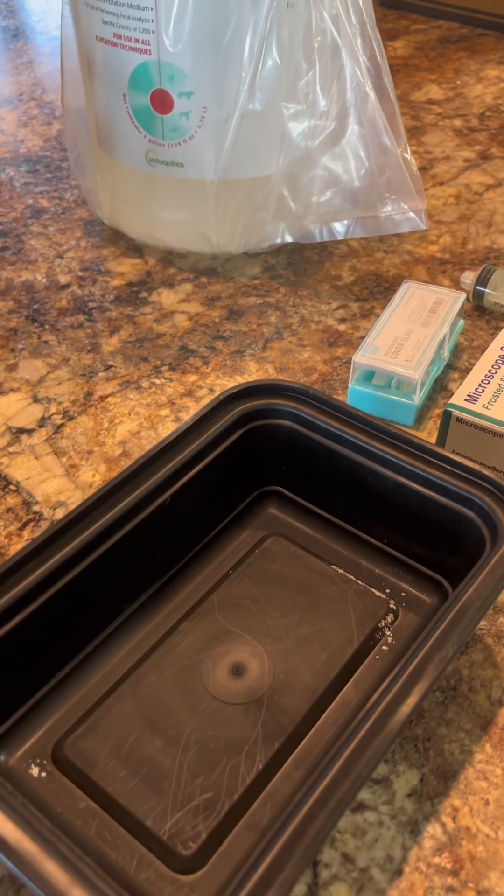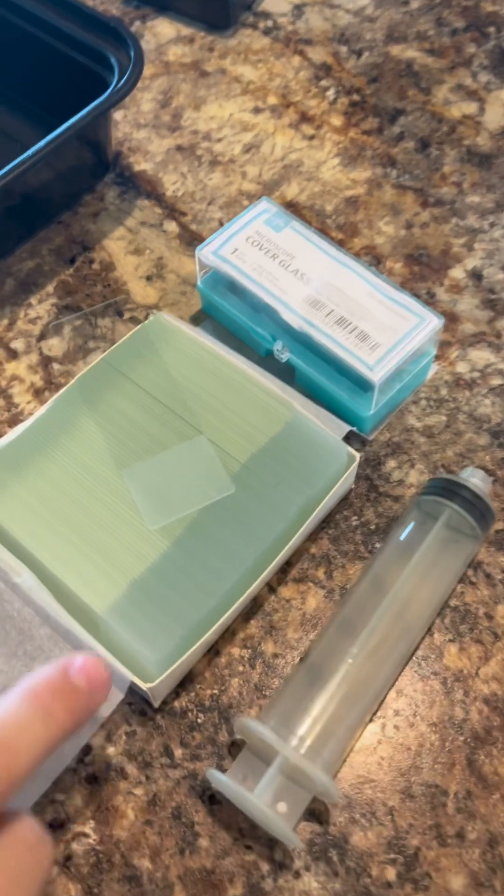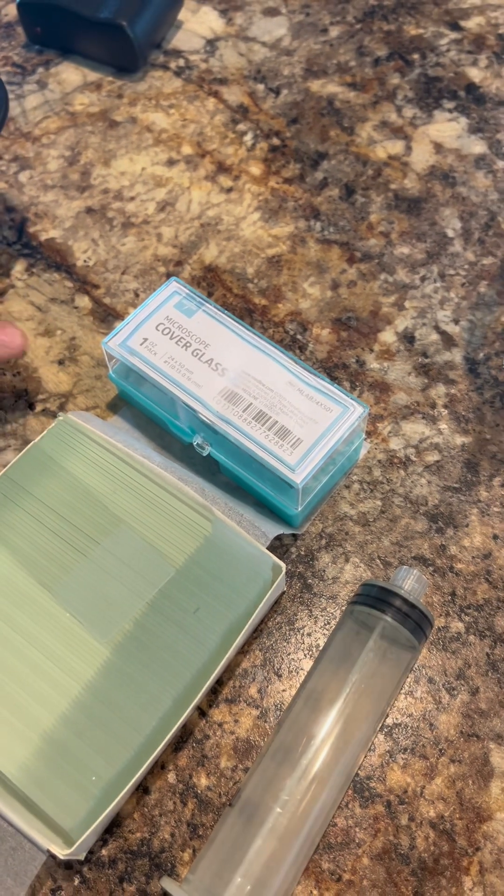You need a small Tupperware, a syringe, microscope slides, and glass cover slips.